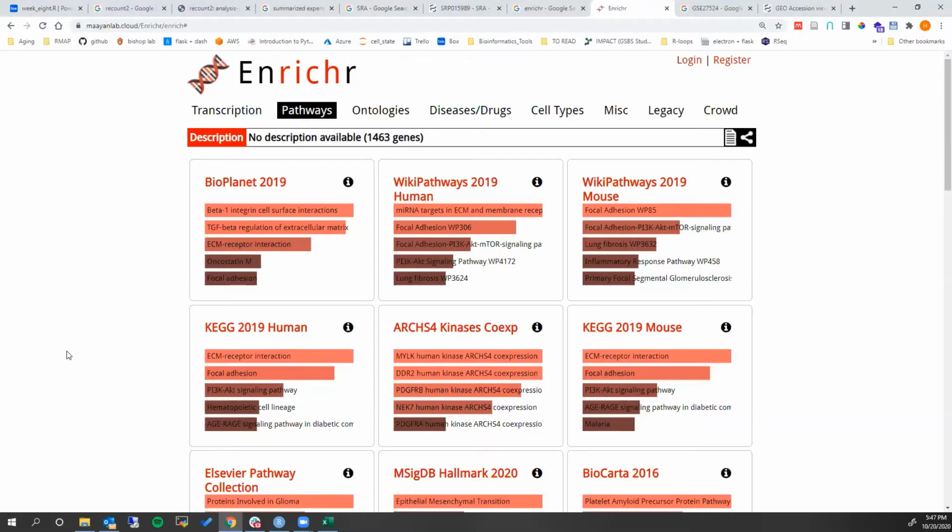All right, so in a nutshell, that's my shorthand biological interpretation here, just to give you a glimpse into how I would think about doing this. Before you do the first hands-on activity, does anybody have any questions about what I've done here, or how I'm interpreting these results?